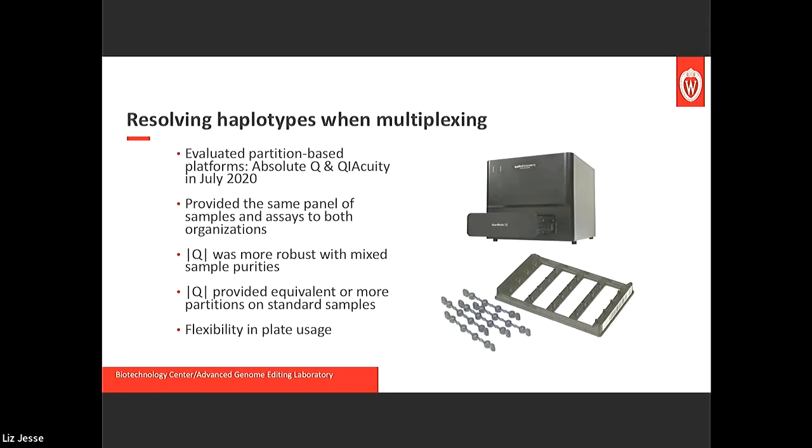And since a lot of the time we're starting to do more and more quick and dirty PCR, I mean, who really all the time wants to have hyper pure DNA and measure that, right? So sometimes for cell lines, we're just taking a little bit of media, bringing it up to 95 degrees, killing the cells and using that. But there can be weird stuff in your mix, and having to always worry about whether that's affecting the emulsification was not ideal.